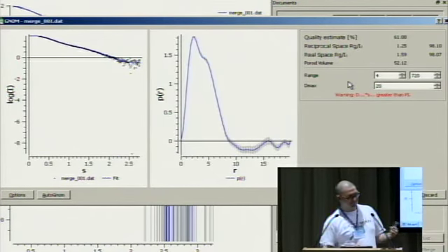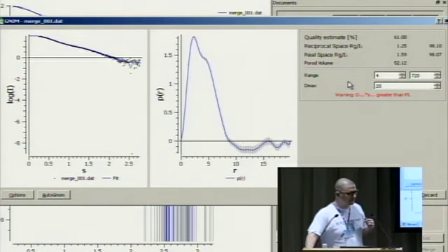If you want to know if the Dmax is, for example, 9 or 10, will you use the quality estimate? Like, you mean if we have to choose between 9 nanometers and 10 nanometers, if the quality estimate for 10 nanometers is better, then probably 10 nanometers is the right answer.